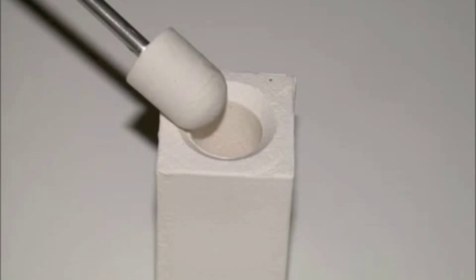The complete system includes a small mortar composed of a porcelain zirconium composite and pestles made of the same composite.